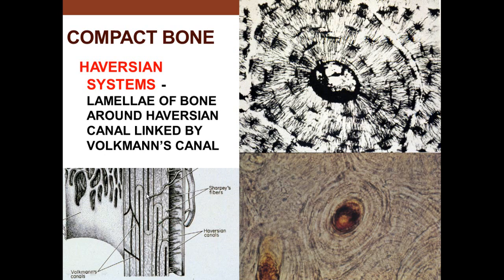And here you can see these are Haversian systems. Another word is osteon. And here's a whole system itself. There's another one right there. The Haversian canal, the canaliculi, the osteocytes are located in through there. And then the Volkmann's canal brings nutrients from the endosteum and the periosteum, as you see in through there, and it goes to the Haversian system, and that's the source of the nutrients. So nutrients come in from the periosteum, through the Volkmann's canal, through the Haversian canal, and then pass by gap junctions between adjacent cells to feed these cells inside.